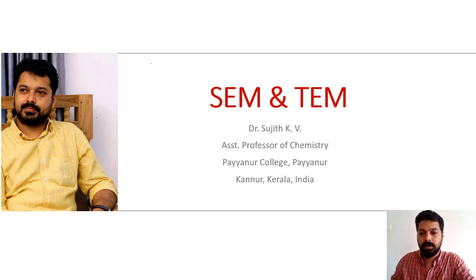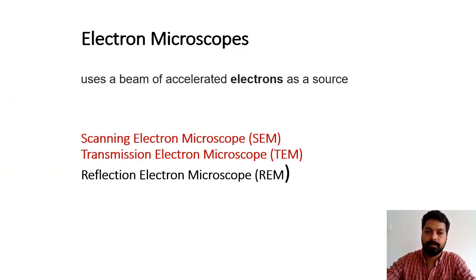Welcome all to the topic electron microscope, in particular SEM and TEM. Usually, when I say electron microscope, we use a beam of accelerated electrons as a source to detect the enlarged matter.